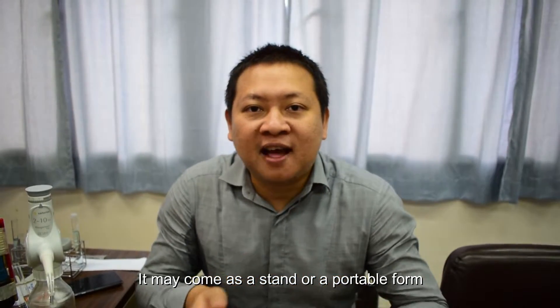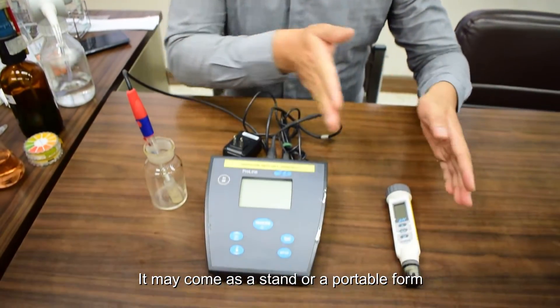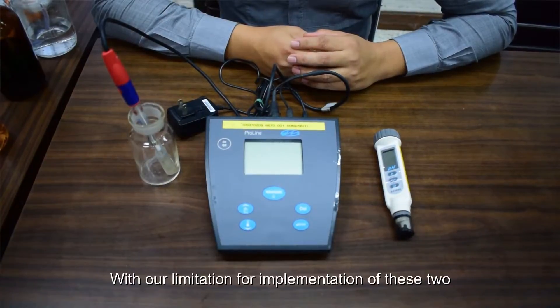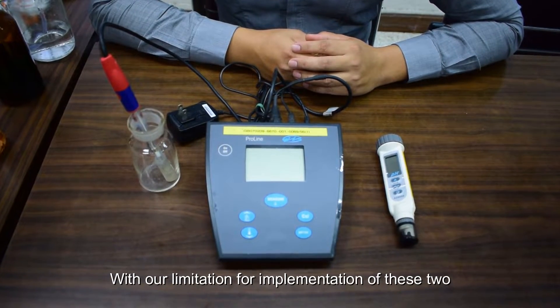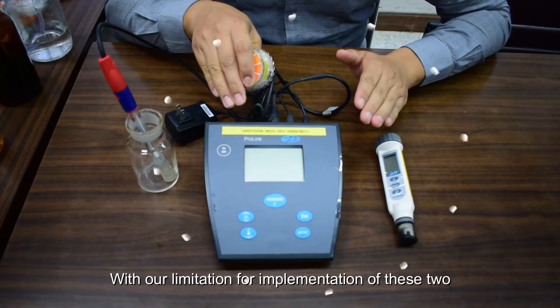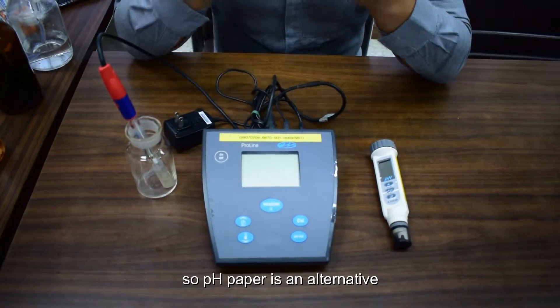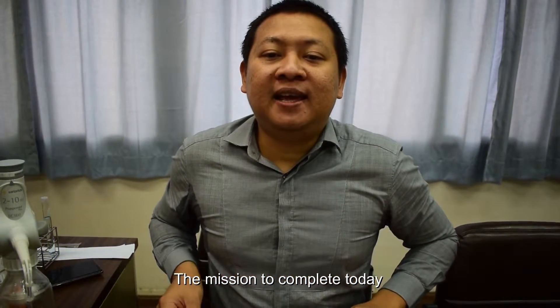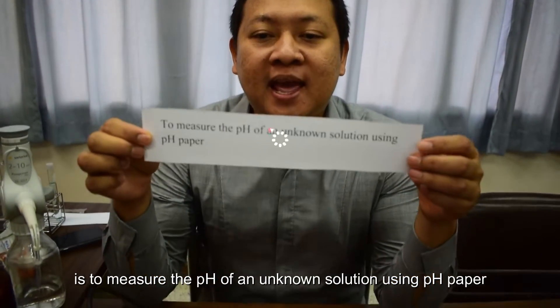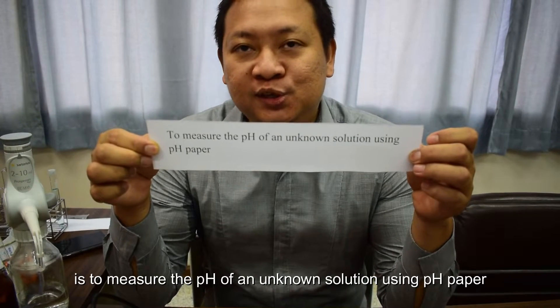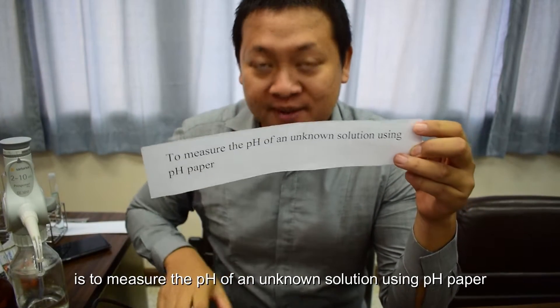It may come as a stand or a portable form. Without limitations for implementation of these two formats, pH paper is an alternative. So the mission to complete today is to measure the pH of an unknown solution using pH paper.